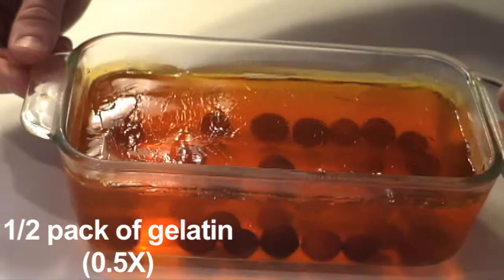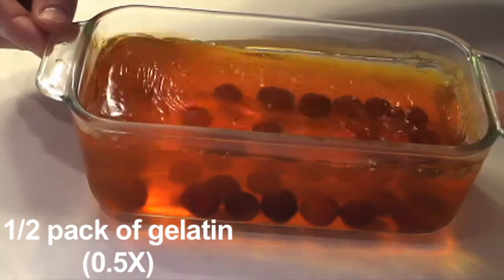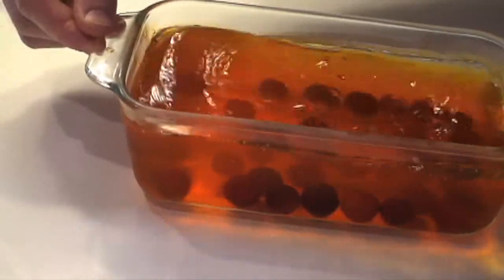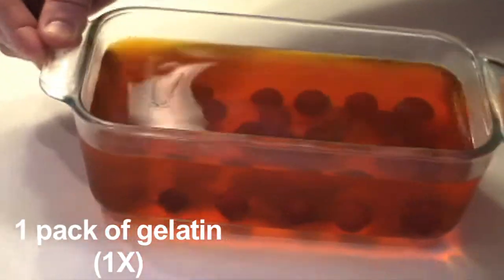Let's look at a higher concentration. Here, this was 0.5x, 1/2 pack. And you can see the gelatin's moving, kind of funny, but it's not nearly as rapid as the 0.25x, the 1/4. Here is the 1 times, the 1 package of gelatin. You can see this is just like normal gelatin. This is what you'd expect to see. The pore size is very, very small now.